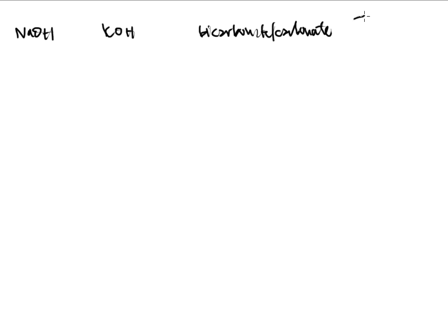Well, that's kind of the key word. I'm going to put common here. Okay. So there's tons of other choices that we can use in ion chromatography in order to do our separation. We've got recipe after recipe after recipe, really depending on what we want to separate. Are we separating anions? Are we separating cations? Are we separating things that all have the same charge? Or are we separating things that have different charges? Are we separating things in very high amounts? Are we separating things in very low amounts? So those are just the most common scenarios that you might run across in a lab.